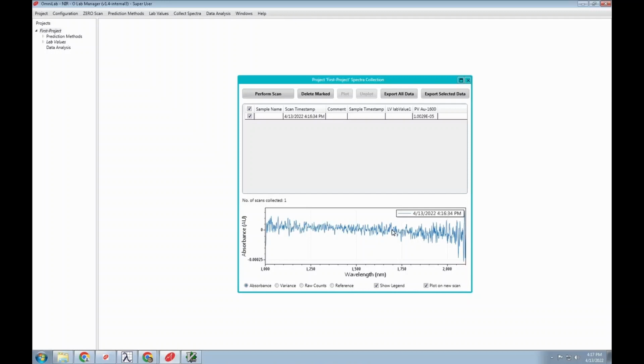This channel actually physically has a jumper on it. I don't have a probe and sample material here. So we're just taking scans of nothing. So you get the typical noise pattern scan that you get when the channel's jumpered up. If you want to take another scan, you just push the button again.